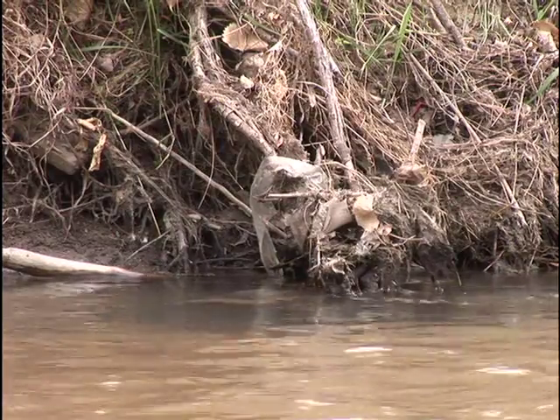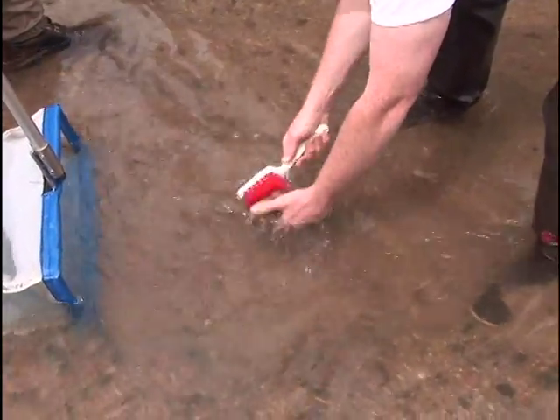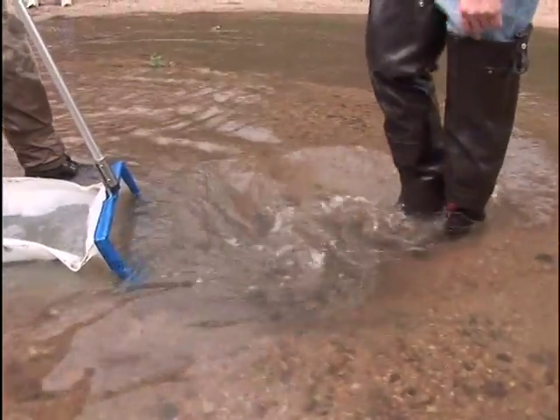We'll also be spending time sampling the water column itself, and we also will spend some time sampling this river substrate. The sampling method here calls for a total sample time of 4 minutes. So we're going to take the number of different habitats we have, divide that into the 4 minutes, and spend that amount of time per each habitat. For example, if we only found 4 different habitats, a snag, a sandy substrate, a water column, and an overhanging bank, we'd spend 1 minute on each habitat sampling that particular area.